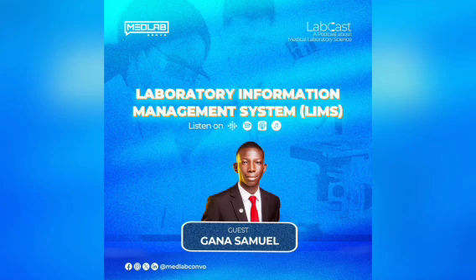All right, thank you for that question. So, of course, we all start small, but I think one major thing that small labs should start with is to use the cheaper LIMS versions. For example, there are different LIMS versions that are available, depending on what your budget takes. Depending on what budget you are on.